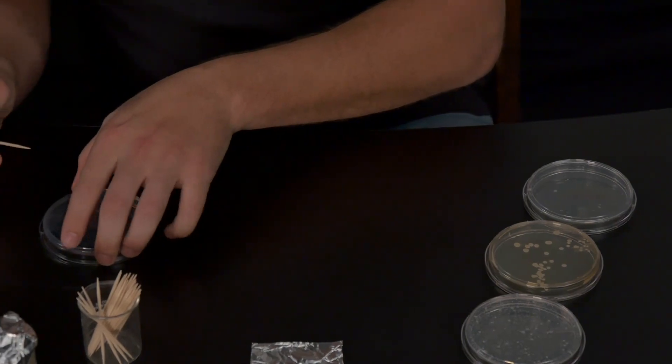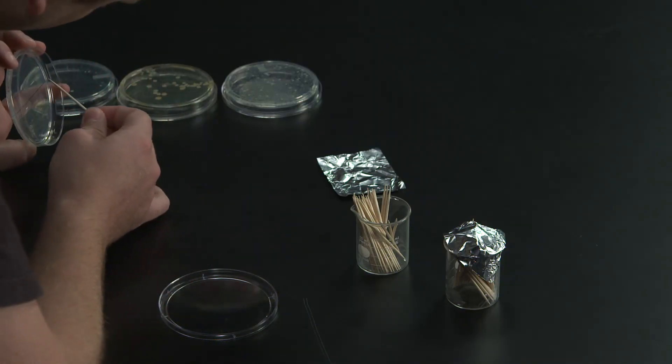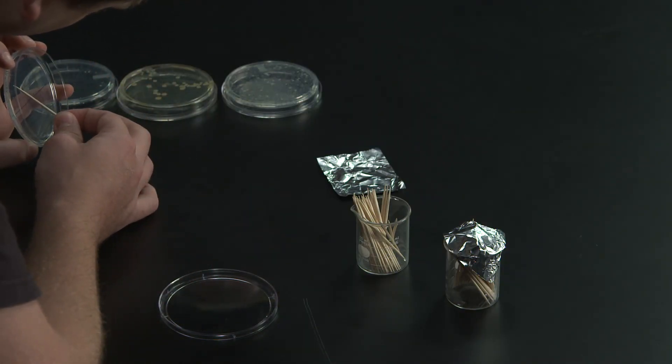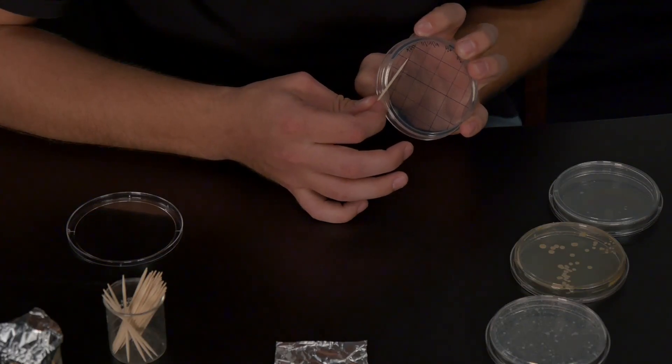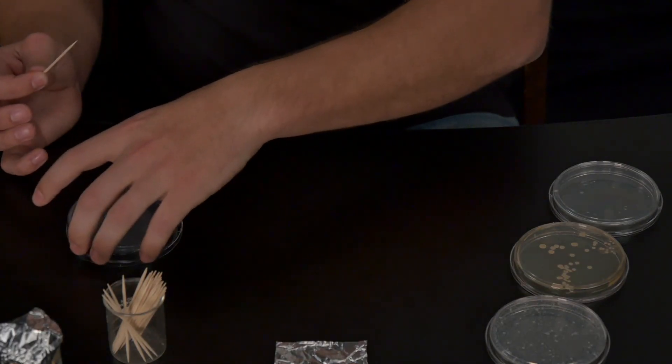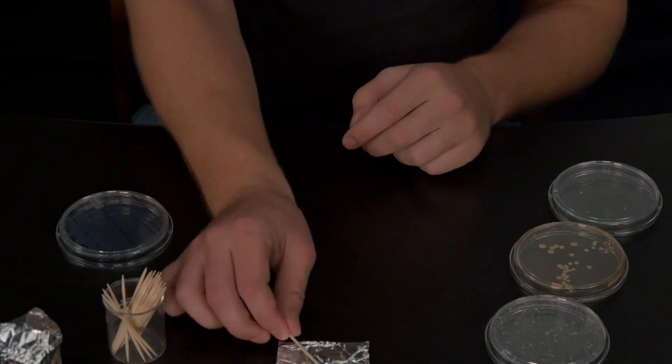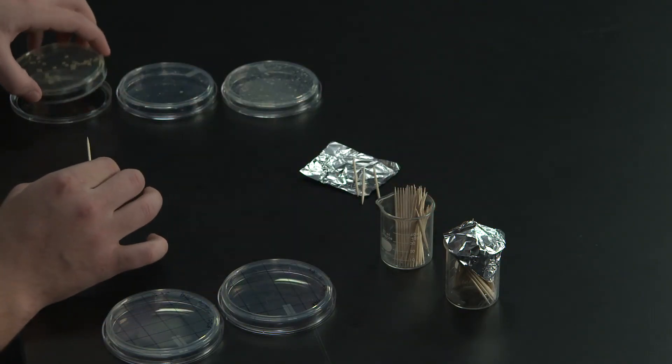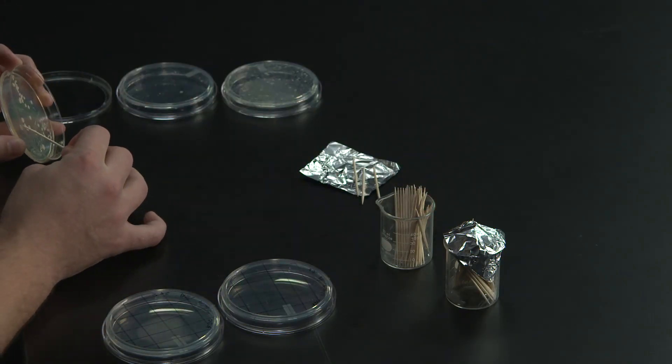With the toothpick, gently touch the center of this colony and transfer it to another plate in the first grid space. On the new plate, be careful not to tear through the agar. It is important that you lightly touch the agar surface as you spread the bacteria.